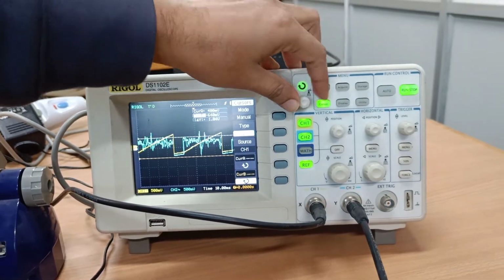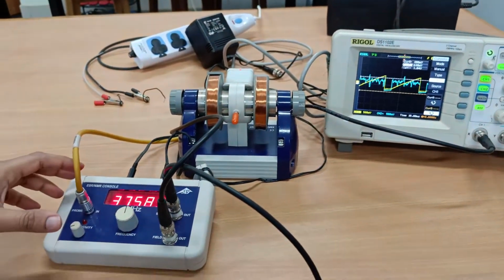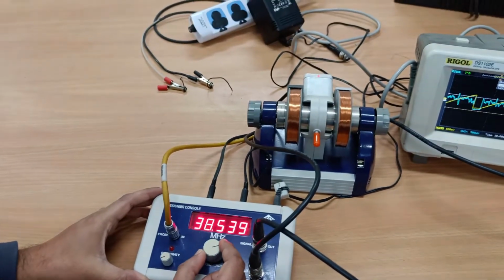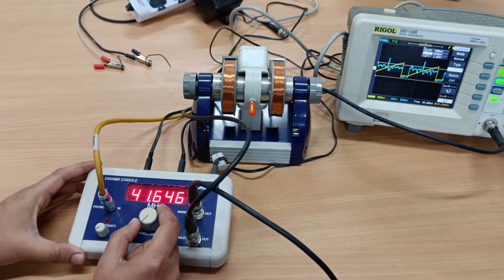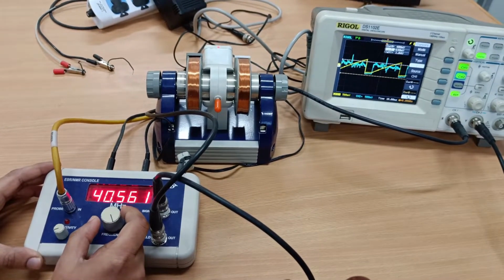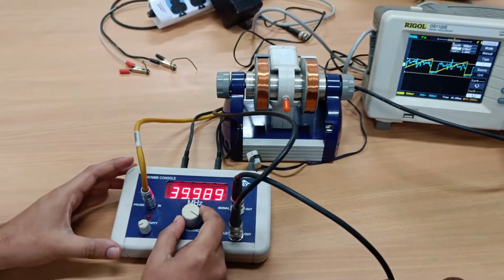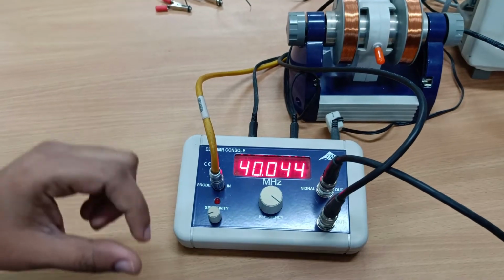Now we are choosing a value. It is 40.044 megahertz. This is the start value.